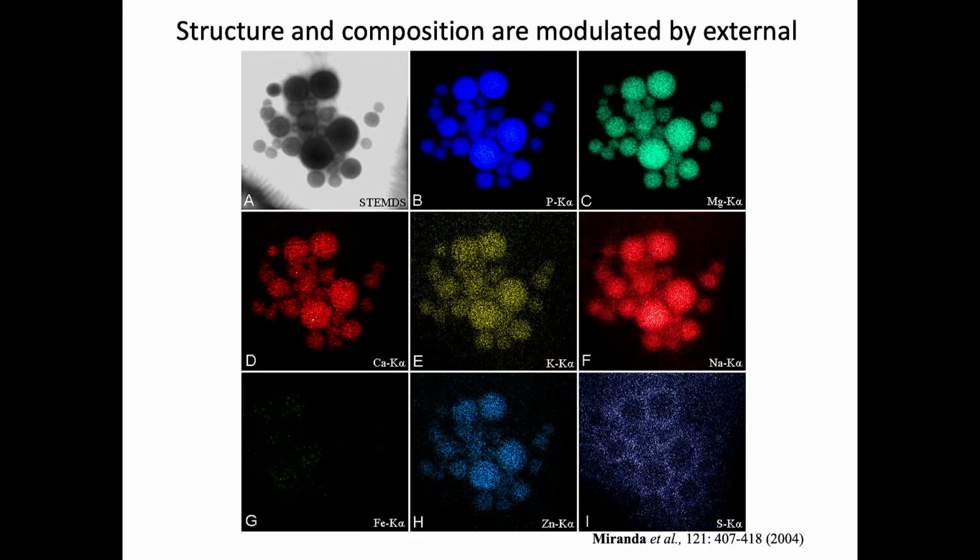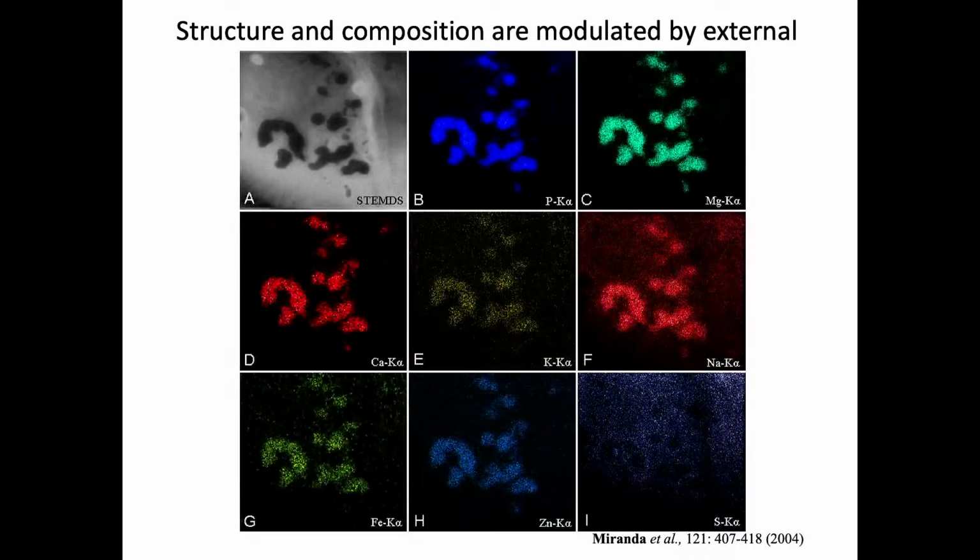Okay. And so then here we can see phosphorus, magnesium, calcium, potassium. So with this work, we showed that they are highly dynamic.